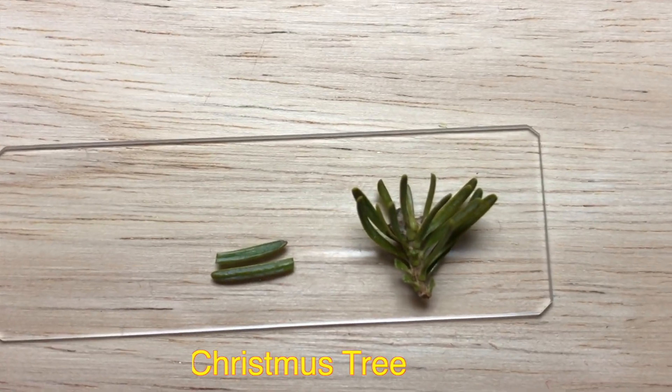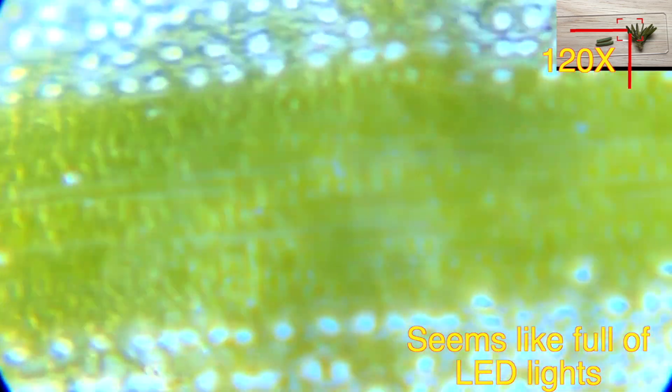Taking Christmas tree needles and looking under the microscope — you can see some pretty interesting LED-like structures. I don't know exactly what they are, but it's cool.